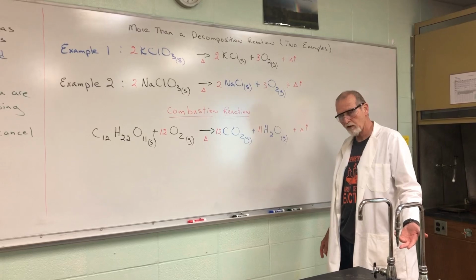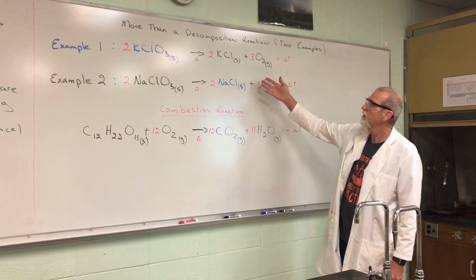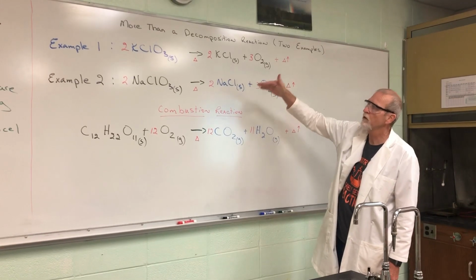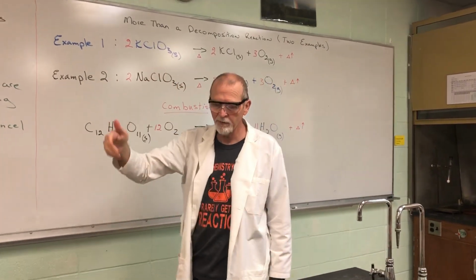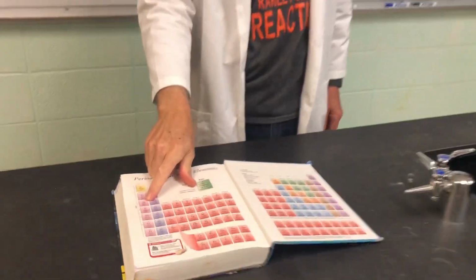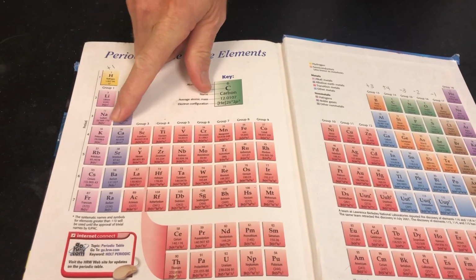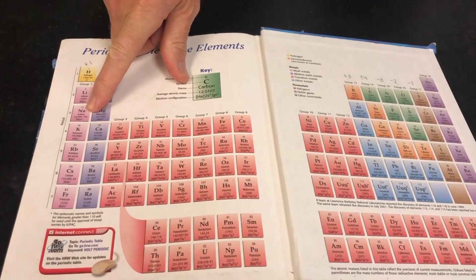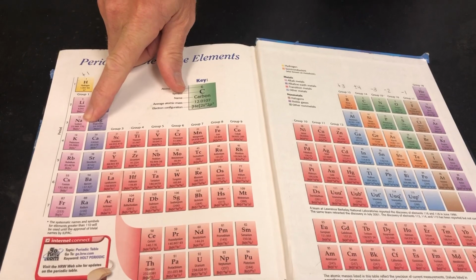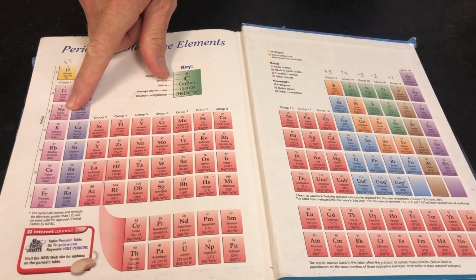So in another carbohydrate, you can get carbon dioxide as well. I wanted you to see that in this reaction because of two separate compounds. Predictably, if you look on the reactivity series, as on your periodic table here, you can see that sodium is listed above potassium. So you would expect, based upon that position, for potassium to react more vigorously than sodium. So we're going to actually look at that today and see if there's any differences in that reaction. They're both going to release oxygen. They're both going to burn the sugar as we have here in the bottom.